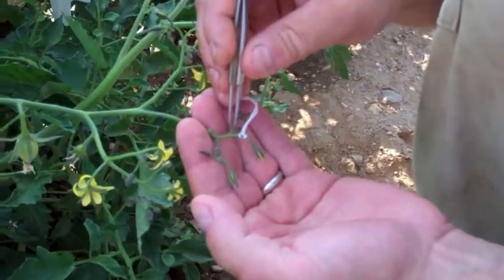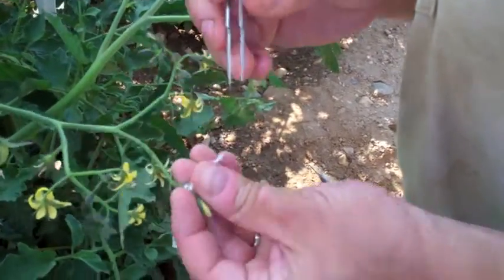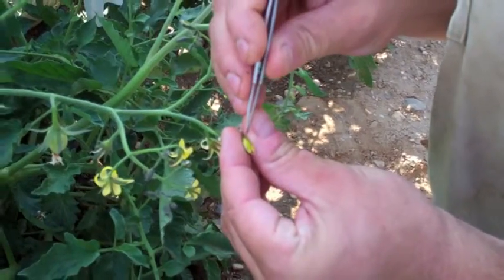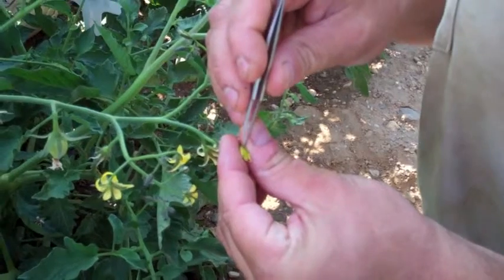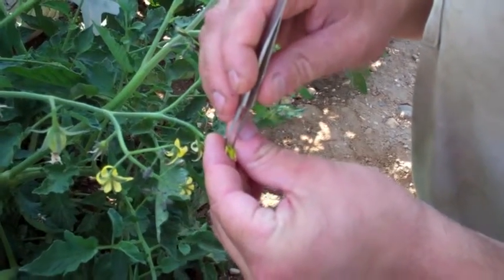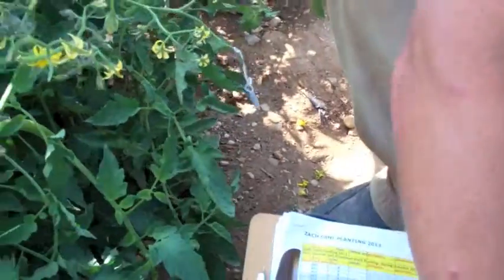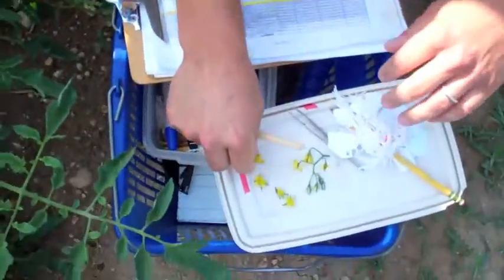You remove the extra flowers, then remove the floral organs with your tweezers. The last step is to get pollen.